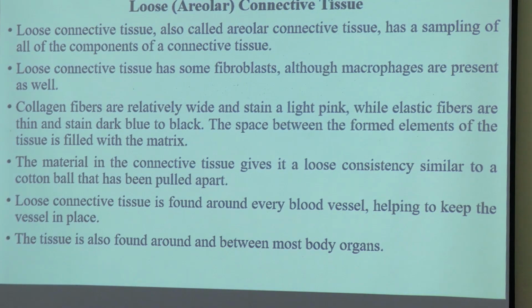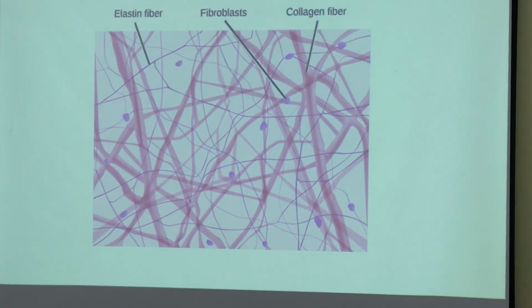Now here is the ideal diagram of loose areolar connective tissue. This is not a histological diagram, this is a schematic diagram.